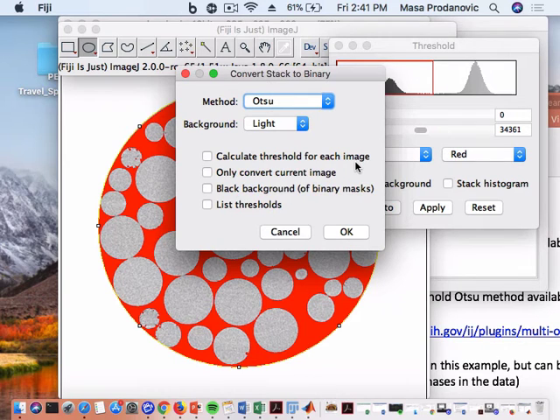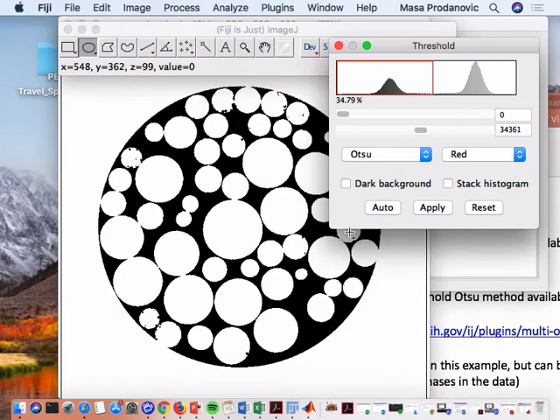If for some reason you actually know that your gray values are skewed, I would rather normalize your gray values as part of the filtering than apply a different threshold on different levels. Especially since we're talking over, what is this, 200 slices, each about 10 microns, okay? There shouldn't be that much variation in threshold levels. So the same grayscale value should be similar everywhere. And you can also pick whether you want a black background and so forth.